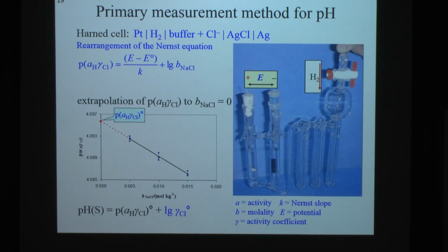And then you have one measurement of artificial seawater by itself, and then to determine the E0 star, the standard potential of the silver-silver chloride electrode in seawater, you have to add small amounts of hydrochloric acid, which is to poise the hydrogen electrode, this one here.